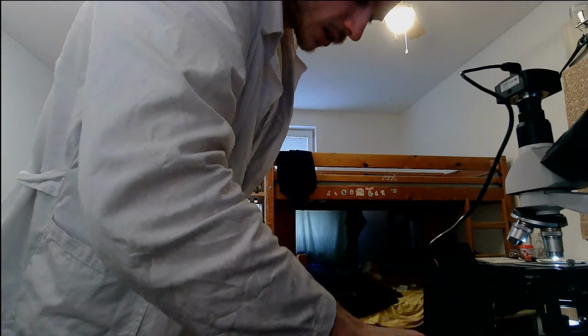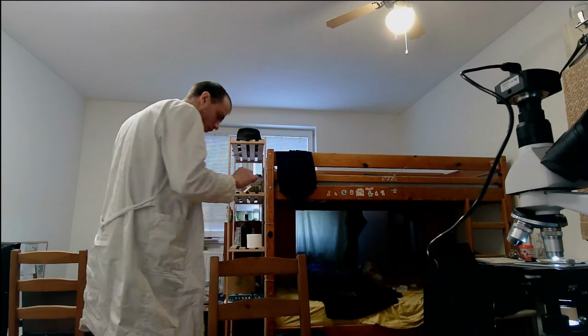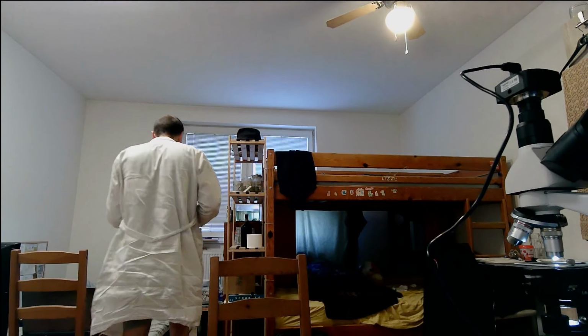I'm gonna try to suck some ostracodes to the sample, or to the glass.